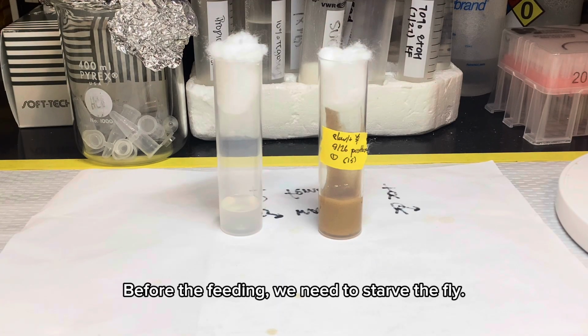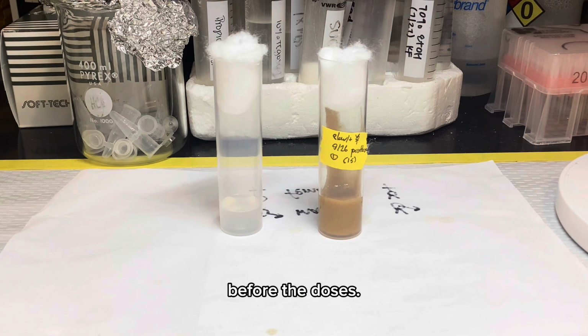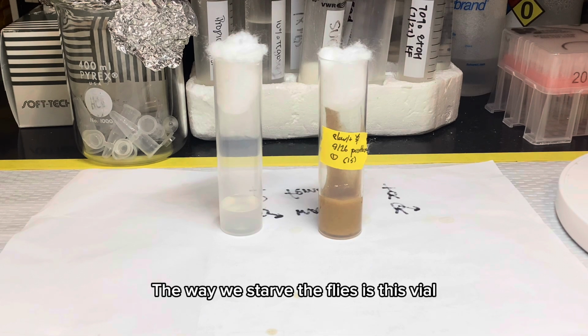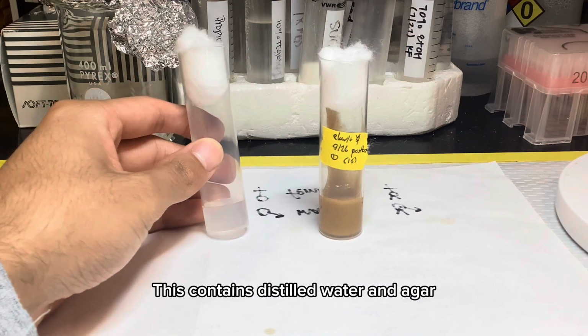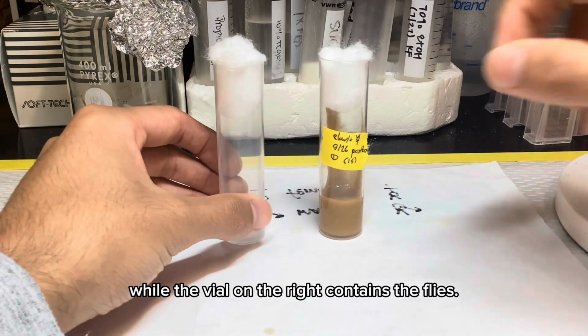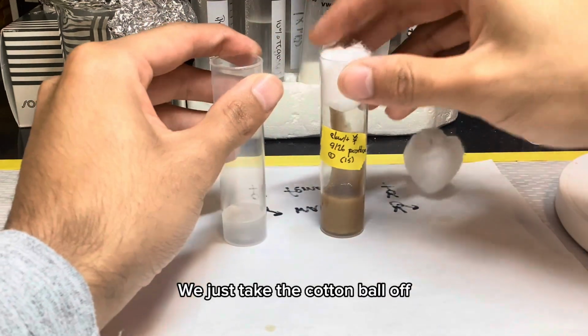Before the feeding, we need to starve the flies. Starvation usually occurs around 10 or 11 a.m. before the doses. The way we starve the flies is this vial on the left is a starvation vial. This contains distilled water and agar, while the vial on the right contains the flies. So we take the cotton balls off.